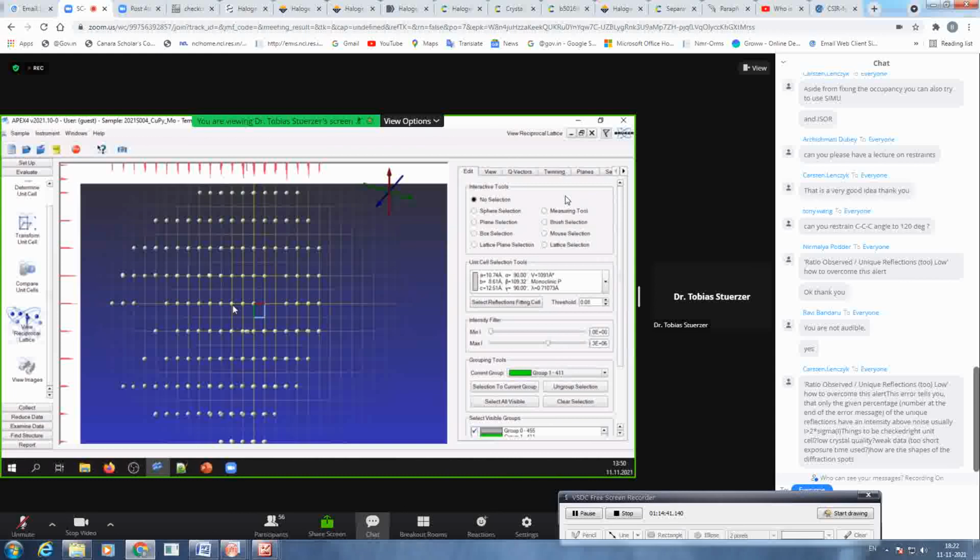So RLED is the best tool, and Kenji highlighted that a lot during the twinning workshop. And this is where we discussed this already. So I can really just encourage you to visit the twinning workshop tomorrow, where we will talk about this. RLED is the best tool to get a very quick idea whether your cell is right or wrong, independent of scores and histograms and whatever. Humans are so good with their eye with pattern recognition that you immediately see whether the unit cell is right or wrong.